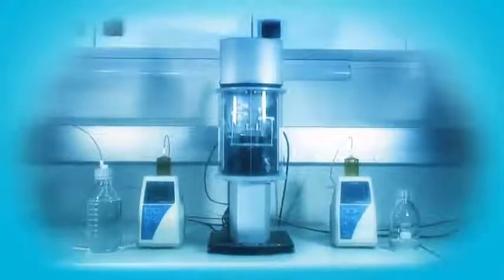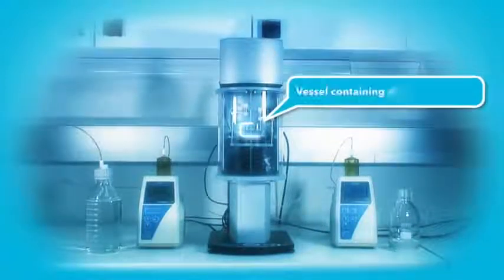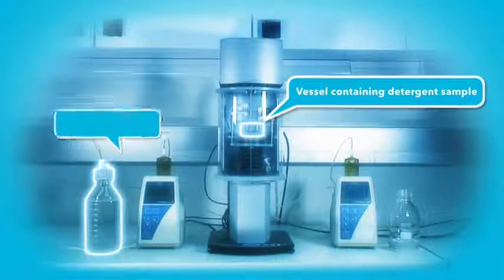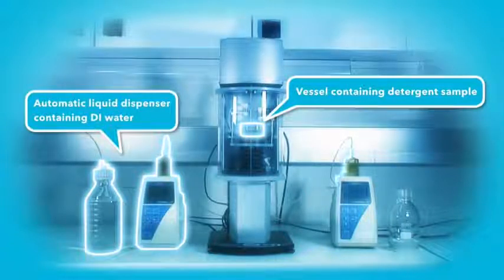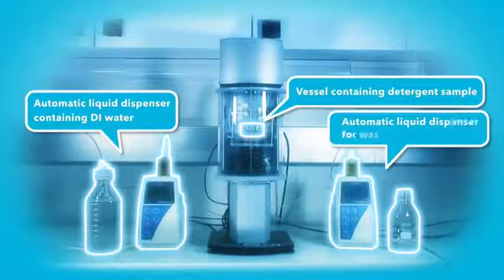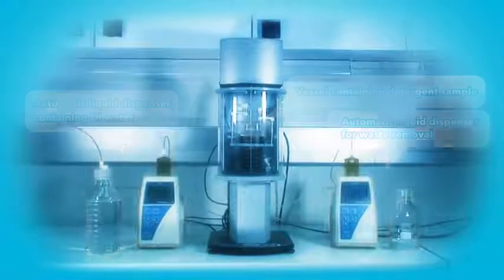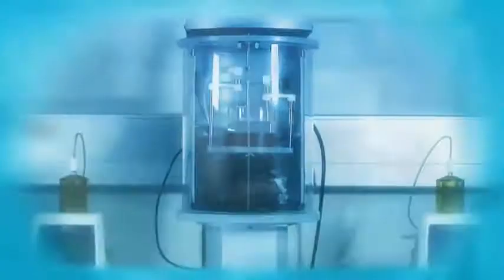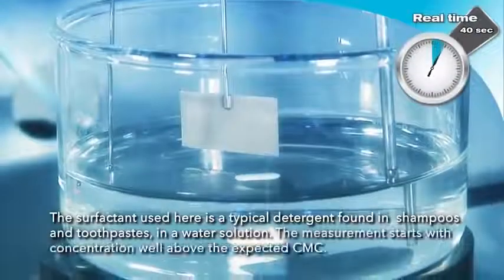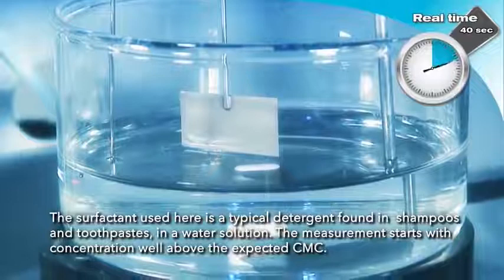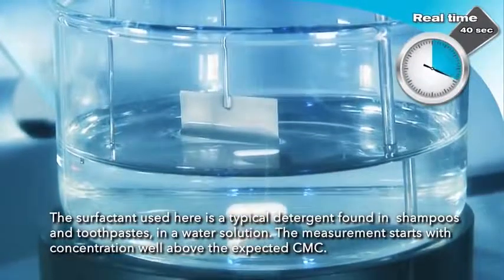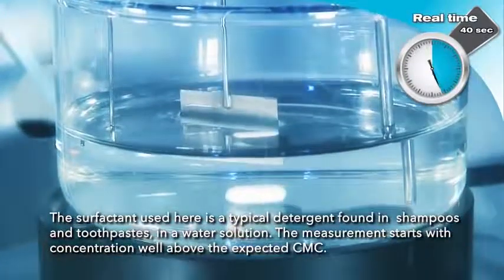A concentrated surfactant solution is on the sample stage and two dispensers are connected to sigma. One dispenser is used to add diluting water and the other to remove excess liquid. The surfactant used here is a typical detergent found in shampoos and toothpastes in a water solution. The measurement starts with concentration well above the expected CMC.